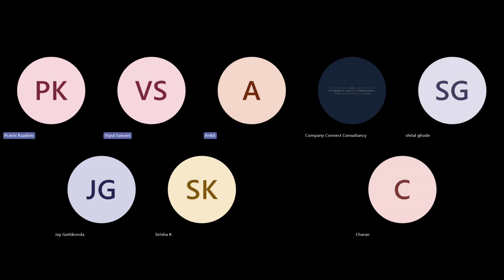Praveen, a quick question. If we decide that we will have multiple cluster application servers, let's say we have an application server number two, we will define it in the Crystal machine, right? On that particular application server, all the prerequisites and the installation of LabWare have to be done, right?